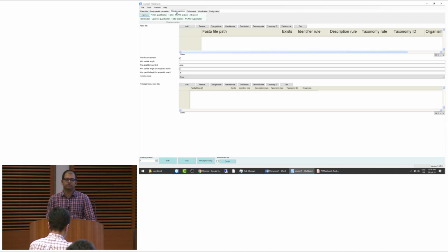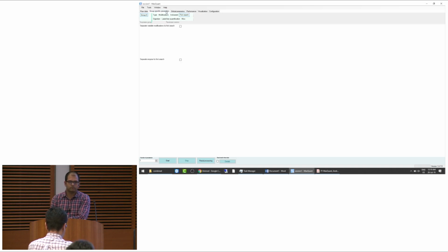Yep. On the last tab, there used to be an option to change the match type for match between runs. Why is that no longer in the newer versions? Because it's not really functional, because when you match, you can match from and to. It doesn't really matter if it is only 2. So we removed that functionality. So it's always bidirectional now.